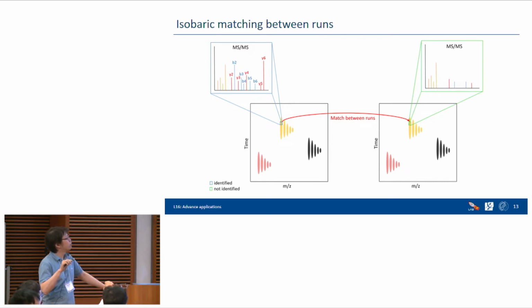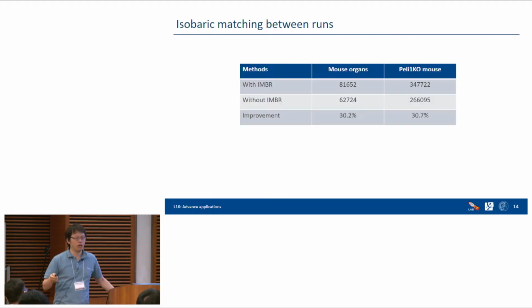The next one has reference channels. Basically, in this paper, there is a gene called PELI1, and their hypothesis is that PELI1 influences brain inflammation. So they injected EAE, which can cause brain inflammation, and then took samples at 0 days after injection, 10 days, and 20 days, from knockout mice and wild-type mice. They have 2 replicates, and they also assigned the samples randomly. So we have 2 datasets, one with a reference channel and one without.